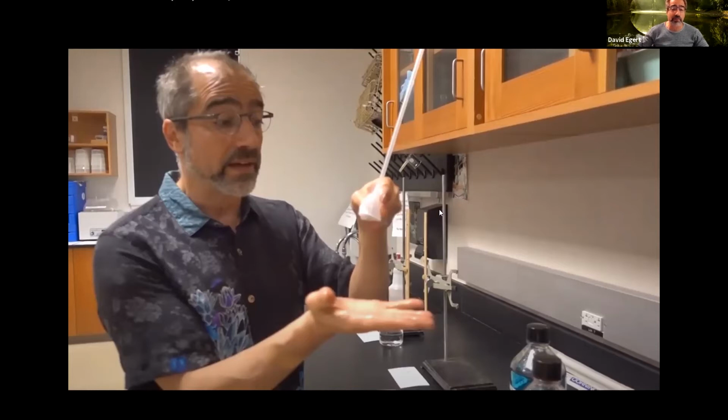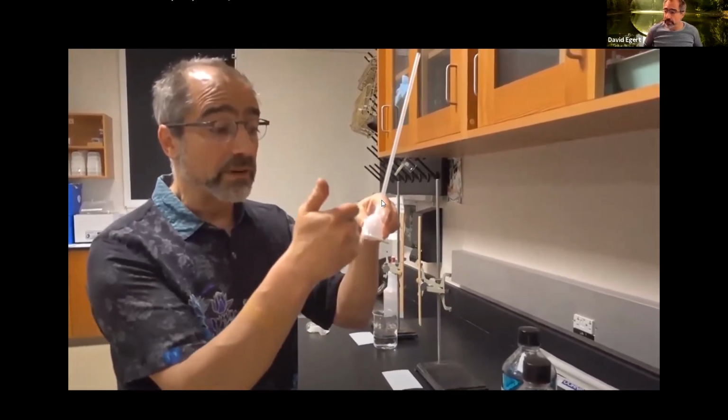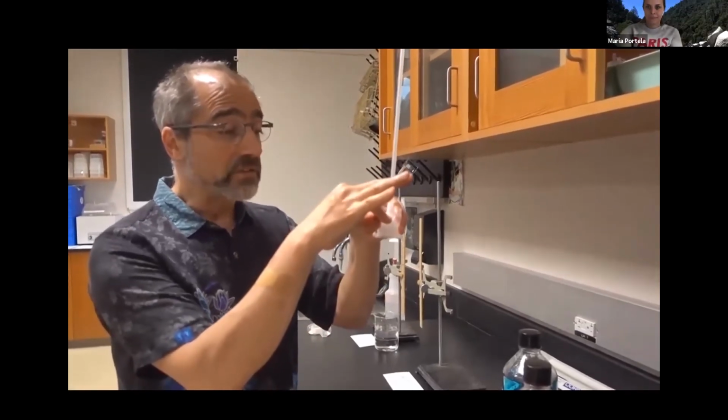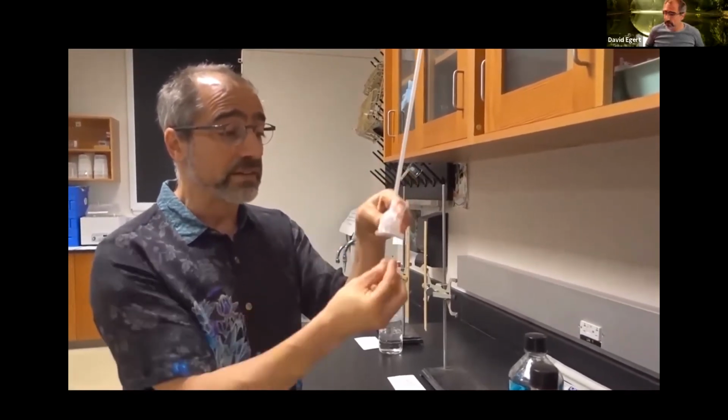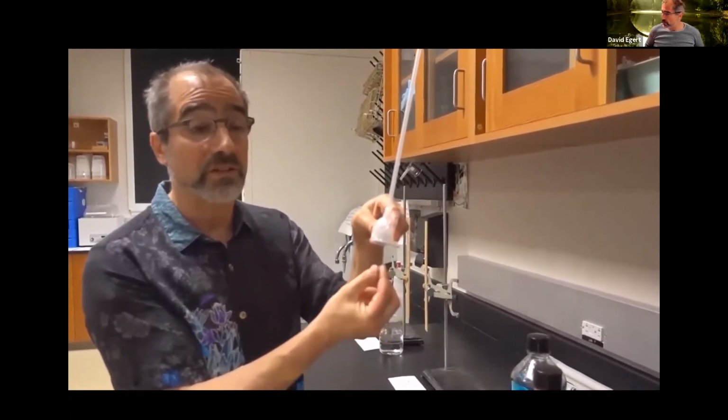So don't think of the dye as something that's part of the experiment other than to make it pretty like this. Okay. A gradient, an osmotic gradient, right? We're going to have a concentration of sucrose on one side, a different concentration, in fact, zero concentration, distilled water, on the other.